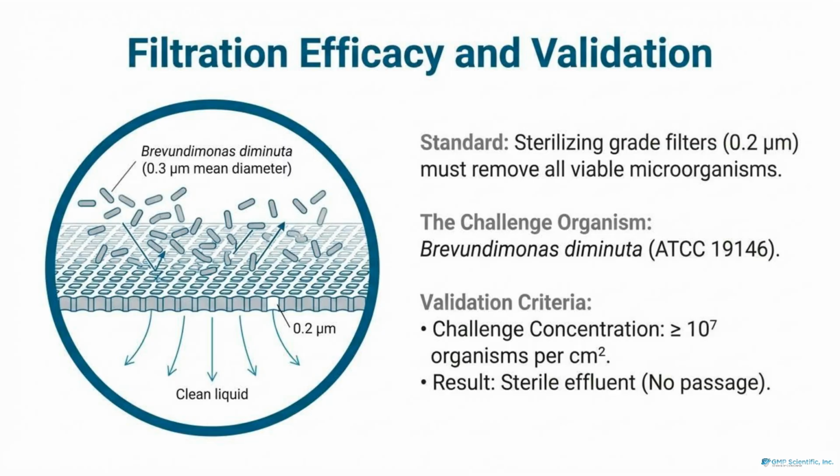For liquid products, we rely on sterilizing grade filters with a 0.2 micron pore size. These are validated using the challenge organism Brevundimonas diminuta to test the filter's limits. Validation requires demonstrating that a high concentration of organisms results in a completely sterile effluent, meaning no passage.